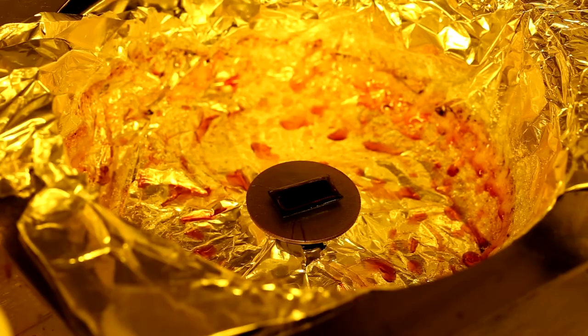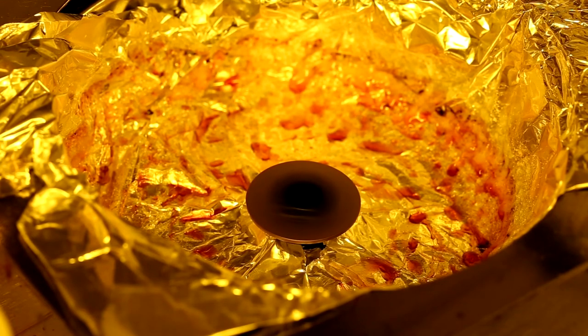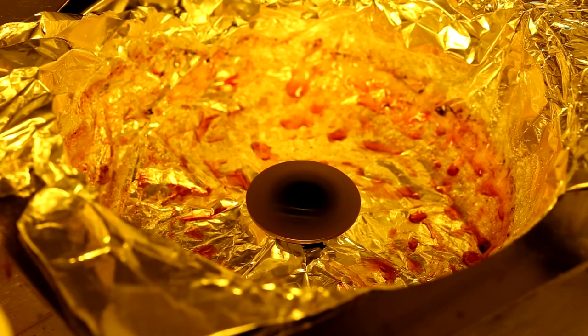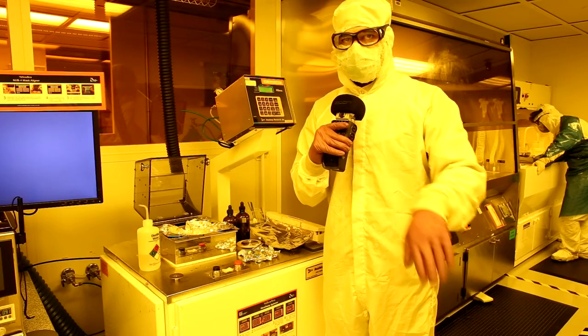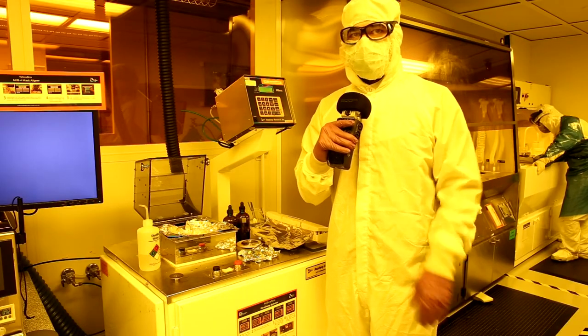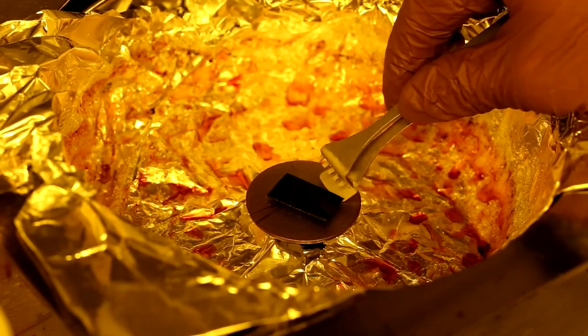substrate. And then this will rotate at very high RPMs so that the liquid polymer that we deposit on top of the substrate will spin very quickly and create an even film around the wafer. And that's how we do photolithography, and we have substrates ready for UV patterning.